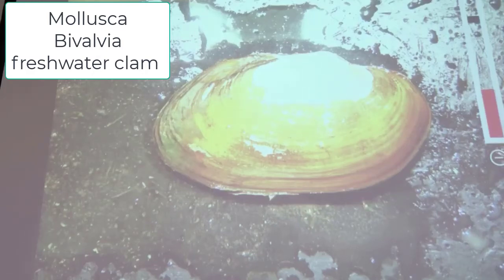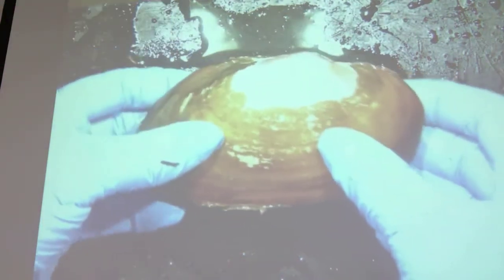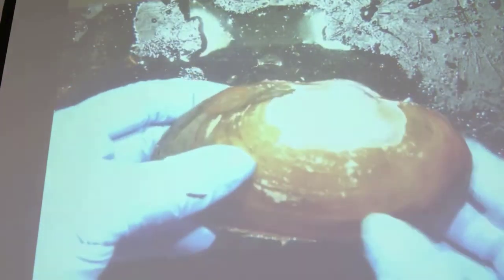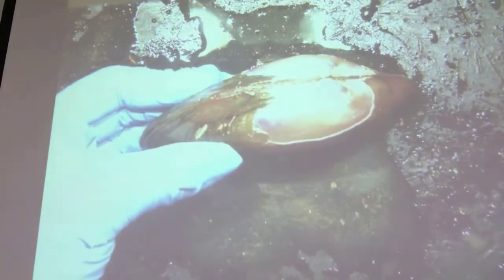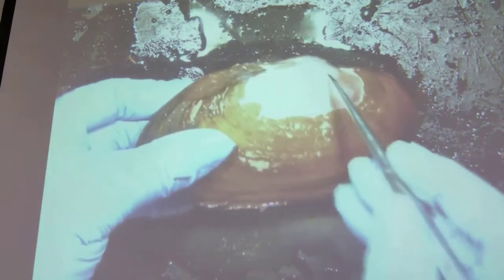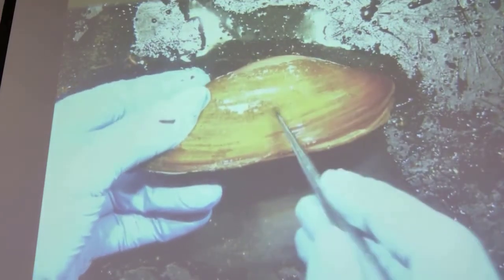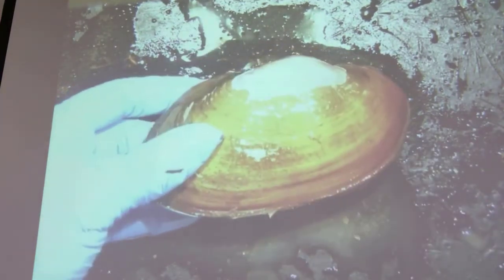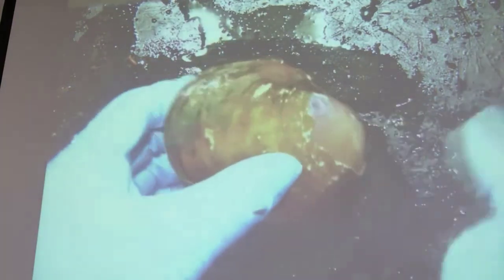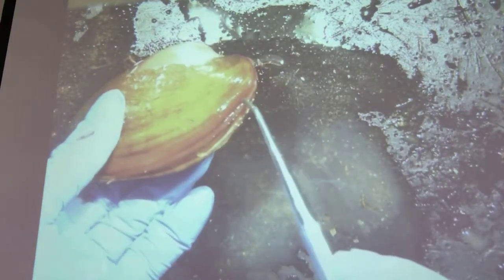Hi, in this video we're going to be looking at the phylum Mollusca, and we will be dissecting a freshwater clam. Just to orient us on the clam, this is the dorsal side with the hinge and the umbo. The ventral side is where the valves open, so these are the two valves of the bivalvia. This is the anterior end, and this is the posterior end.